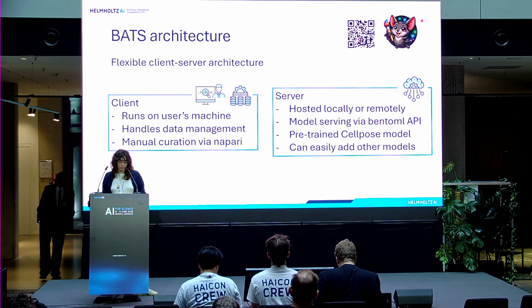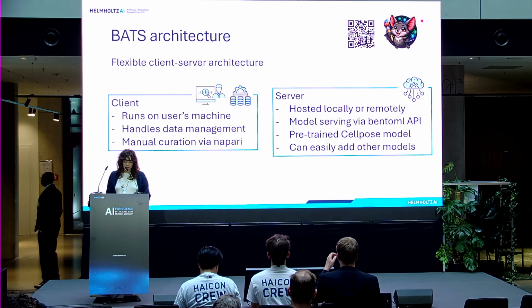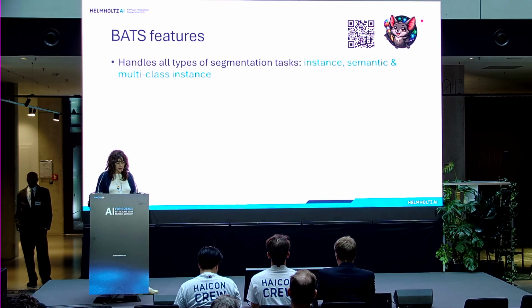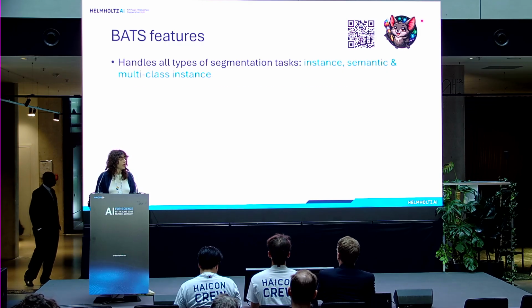We also offer model serving via the BentoML API, which basically handles HTTP requests. And for now, we have a pre-trained Cellpose model, but it's quite easy to add also other models in the backend. It has several features, so we can handle all types of segmentation tasks: instance, semantic, and multi-class instance segmentation.